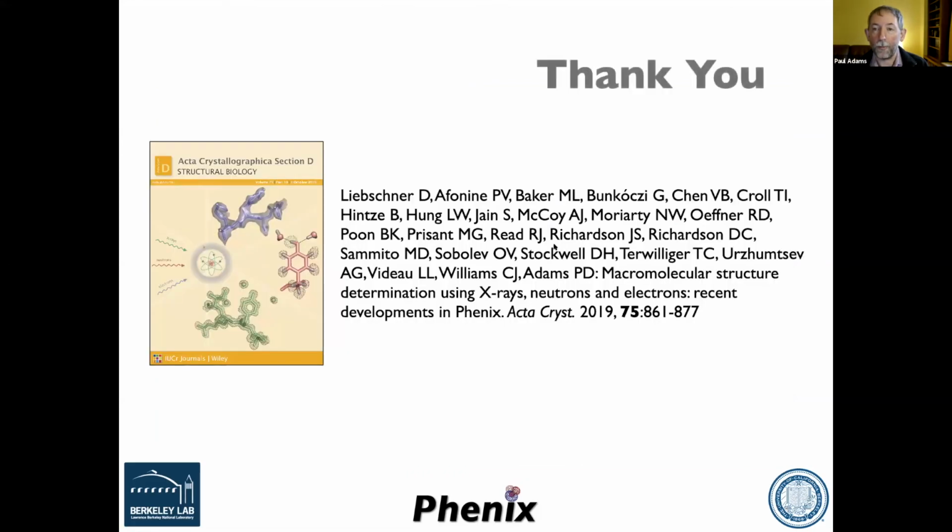So I'll finish and say thank you here, and just remind you that there's this new paper from last year that describes new tools in PHENIX for crystallography, both X-ray and neutron crystallography, and also cryo-electron microscopy. So do check this out if you haven't had a chance already. And if you're going to cite PHENIX in a publication, this is the thing to cite.